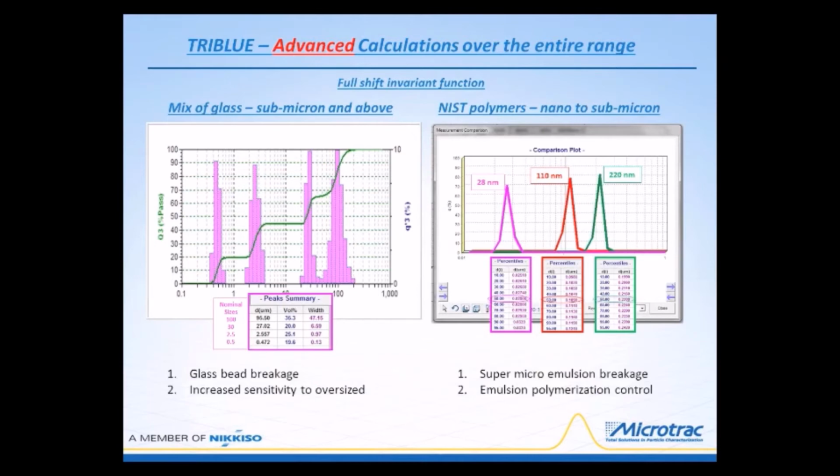Now, the nice thing about this is that if you have large particles and you're worried about those nice spherical particles fracturing in any way, you will have the sensitivity to see those fracturing events, and maintain control over the handling of the material or any other part of the process that can bring about the fracturing of those particles.